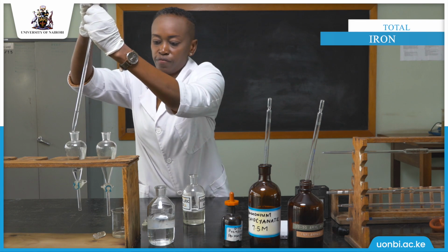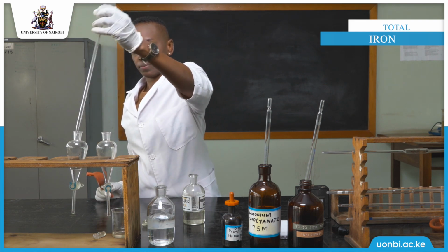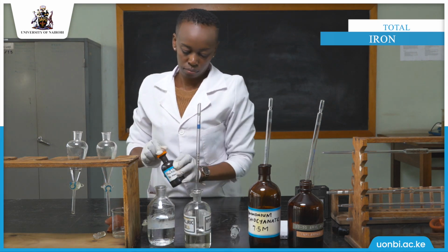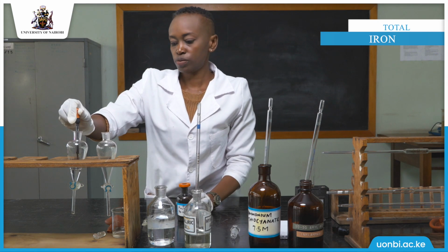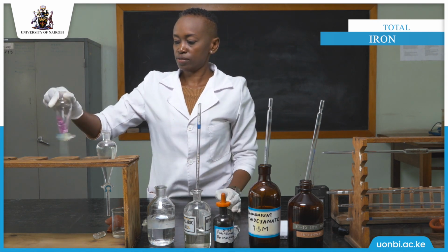One ml of HCl. 2 drops of potassium permanganate. Then we mix.